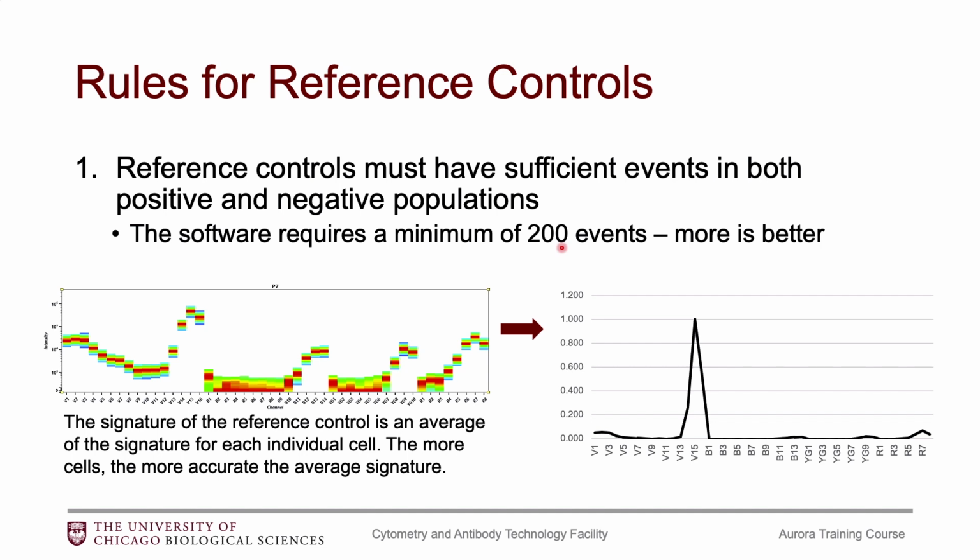And that goes back to averages. So if you recall back when you were a child and you learned about how averages work, an average of 200 total things is going to be not as good as an average of 2,000 total things.